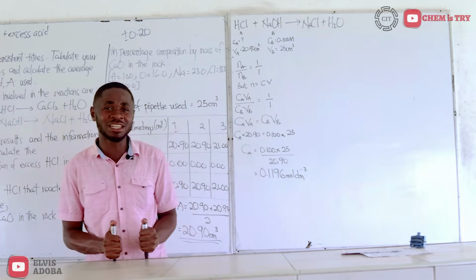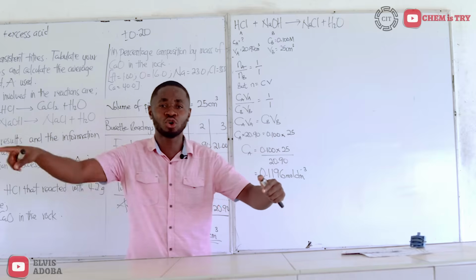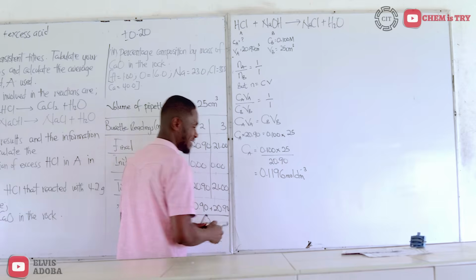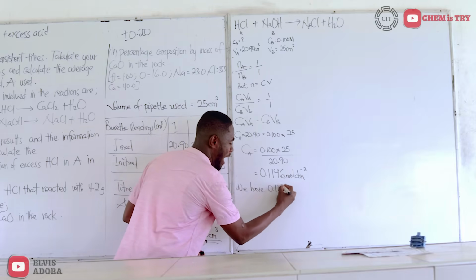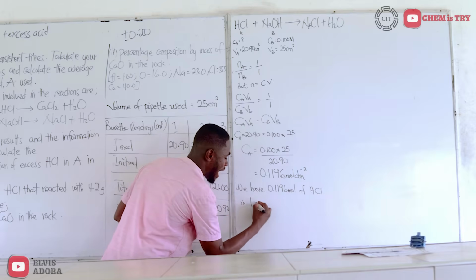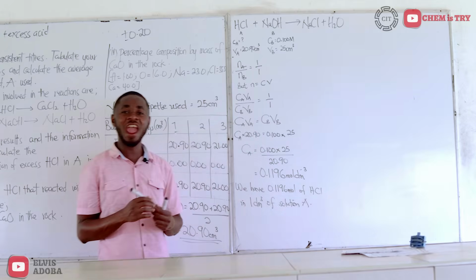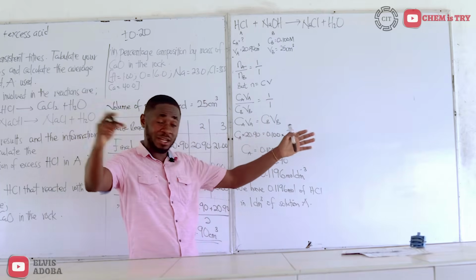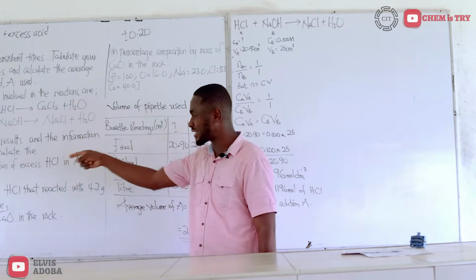Now that is the concentration of excess HCl that was just titrated with the sodium hydroxide. But this one means that we have 0.1196 moles of HCl in 1 decimeter cube of solution A. So the amount of HCl in solution A, given a total volume of 1 decimeter cube, is 0.1196 moles.